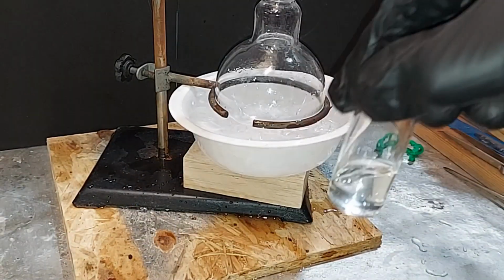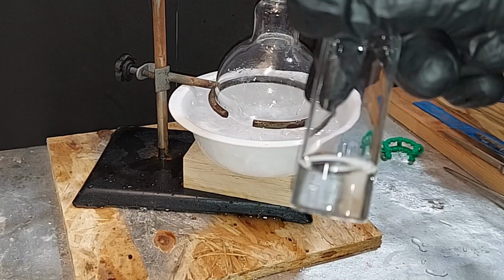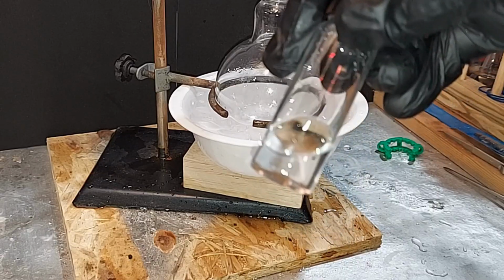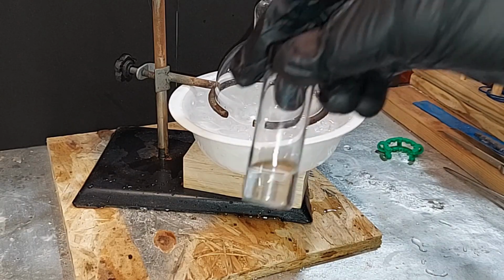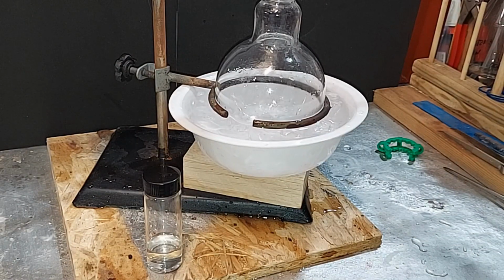Alrighty, here's our formaldehyde. There's probably 12 to 15 milliliters in there. That's it. A lot more than that dripped in there. It's unfortunate so much of it ended up evaporating in spite of the ice, but it is what it is. And I can tell from the odor, the pungent odor, this is definitely formaldehyde. And yeah, at least we got some sample there. It's a demonstration video anyways. Hope you enjoyed it.